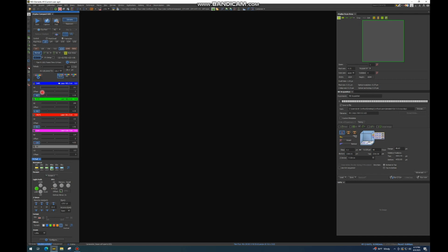You can also adjust offset. However, offset can also be adjusted afterwards, with an image analysis software like ImageJ or Fiji, because we ask that people not use this as an analysis software, in terms of using up time that other people could be using the scope to take images. So it's really important just to strike the balance between gain and laser power.